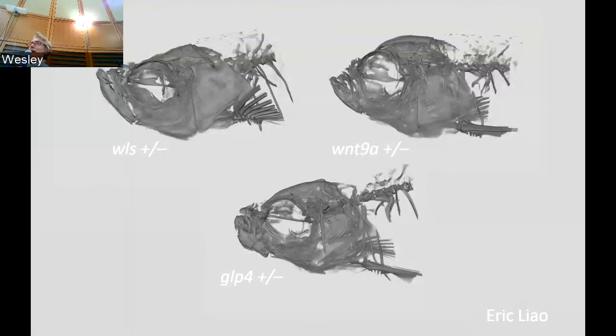And finally, we all have expressed a heartfelt desire to improve interactions with other spoke projects. And so one of the great things about doing these micro CT scans is they're relatively quick, technically simple. They don't require any complicated sample preparation.